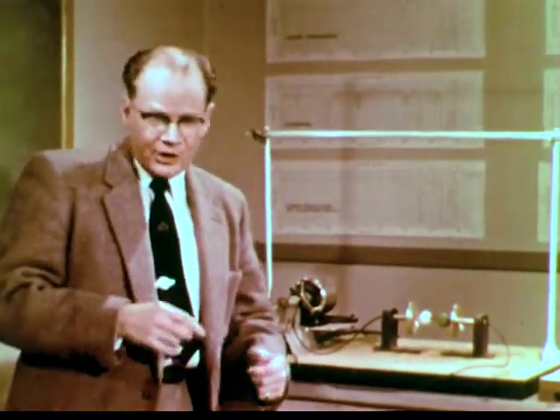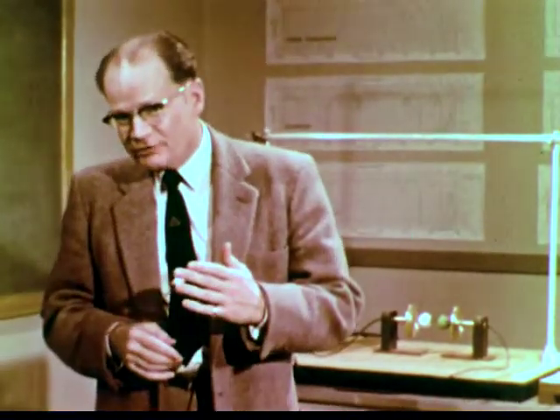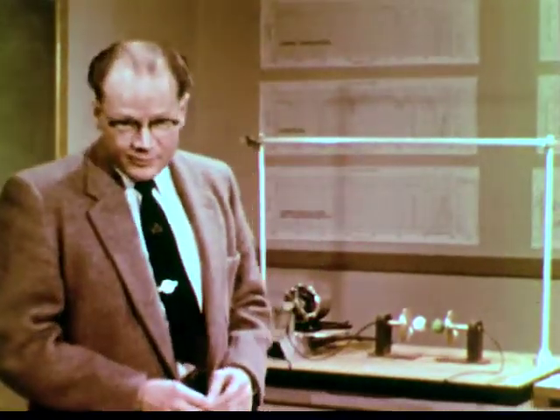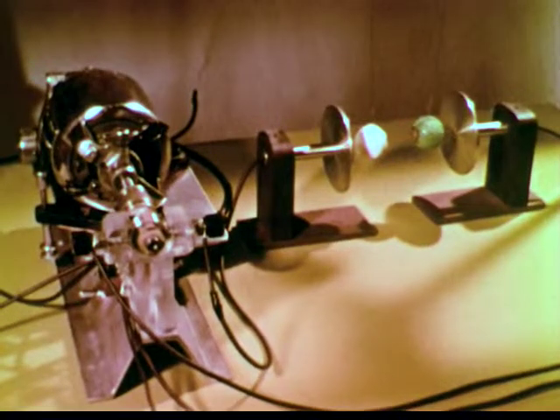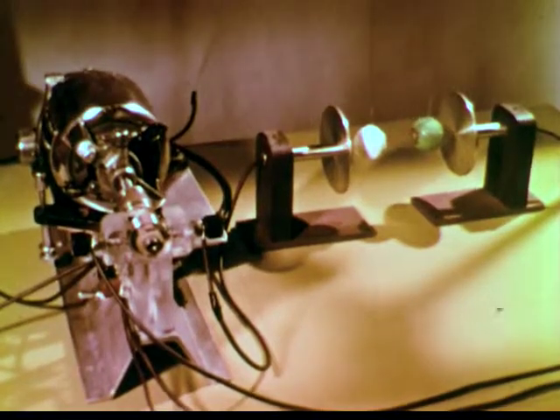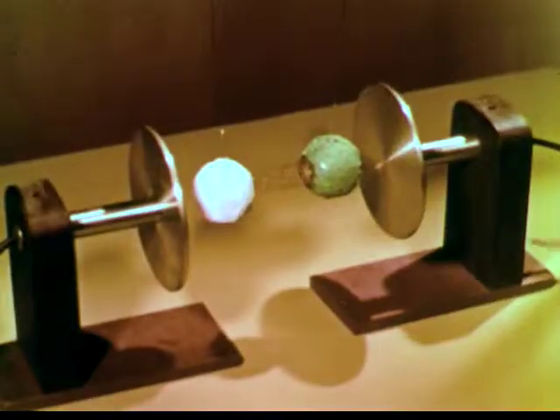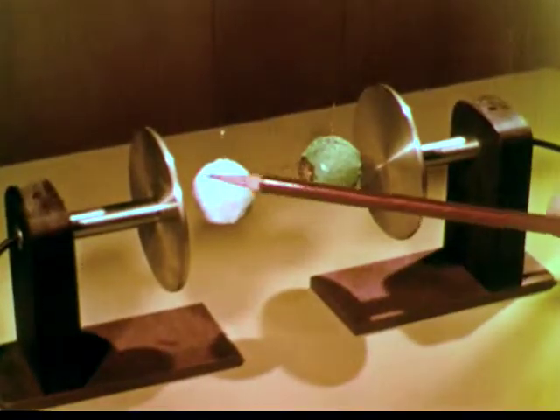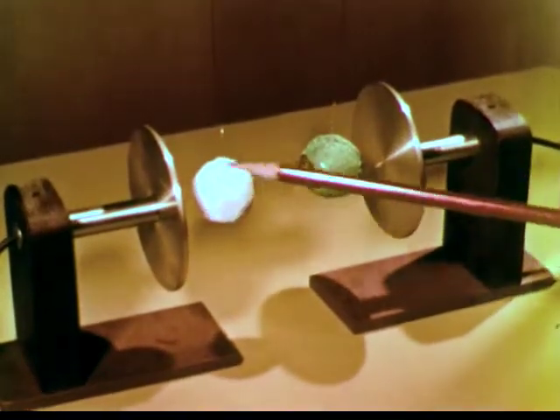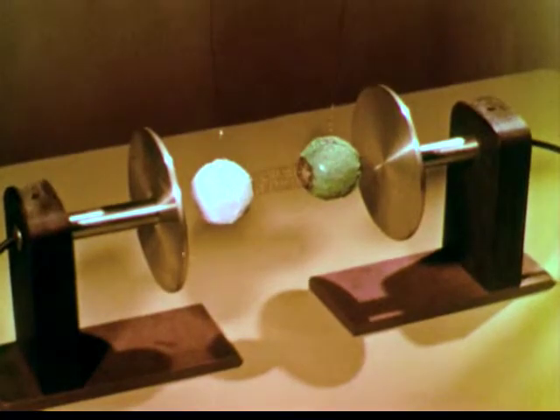while the molecule has different electrical charges on its different atoms. The left to right electrical field will push the positive atoms a little to the right, negative atoms a little to the left, and the right to left electrical field will do just the reverse. We can reproduce this condition by using an electrical generator to charge two condenser plates. With one charged positively and the other negatively, we can switch the charges back and forth and simulate the oscillating electrical effect of a light wave.